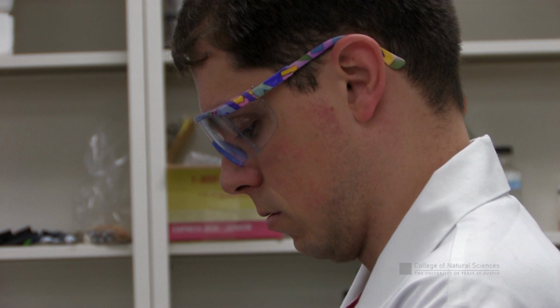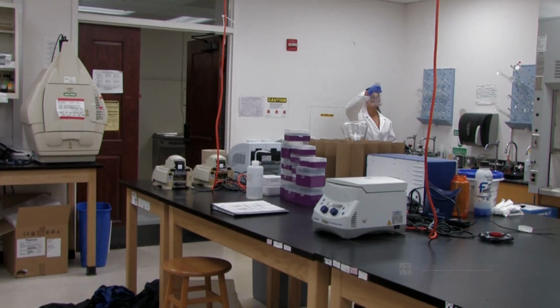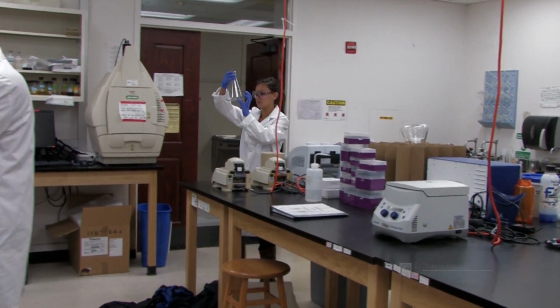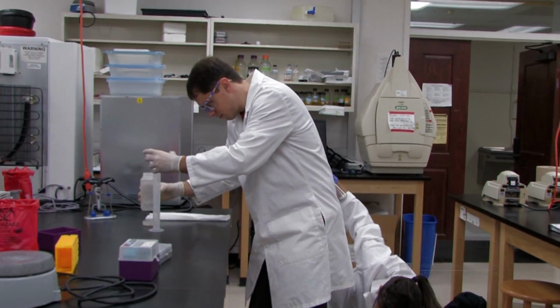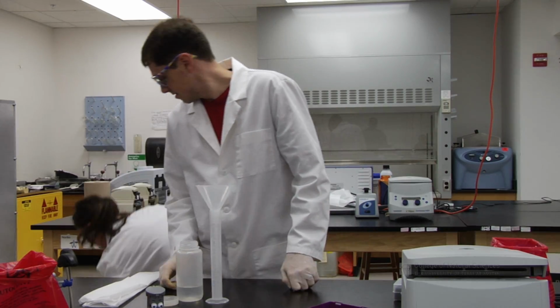Be sure to keep walkways clear and never store backpacks or glass bottles on the floor where they may cause someone to trip or can be knocked over. In teaching labs, when many students are present at one time, it may be difficult to find space for your belongings. If you feel that there is not enough space to store your belongings without placing them in a walkway, ask your instructor where you should put your bags. Don't just let them pile up on the floor.